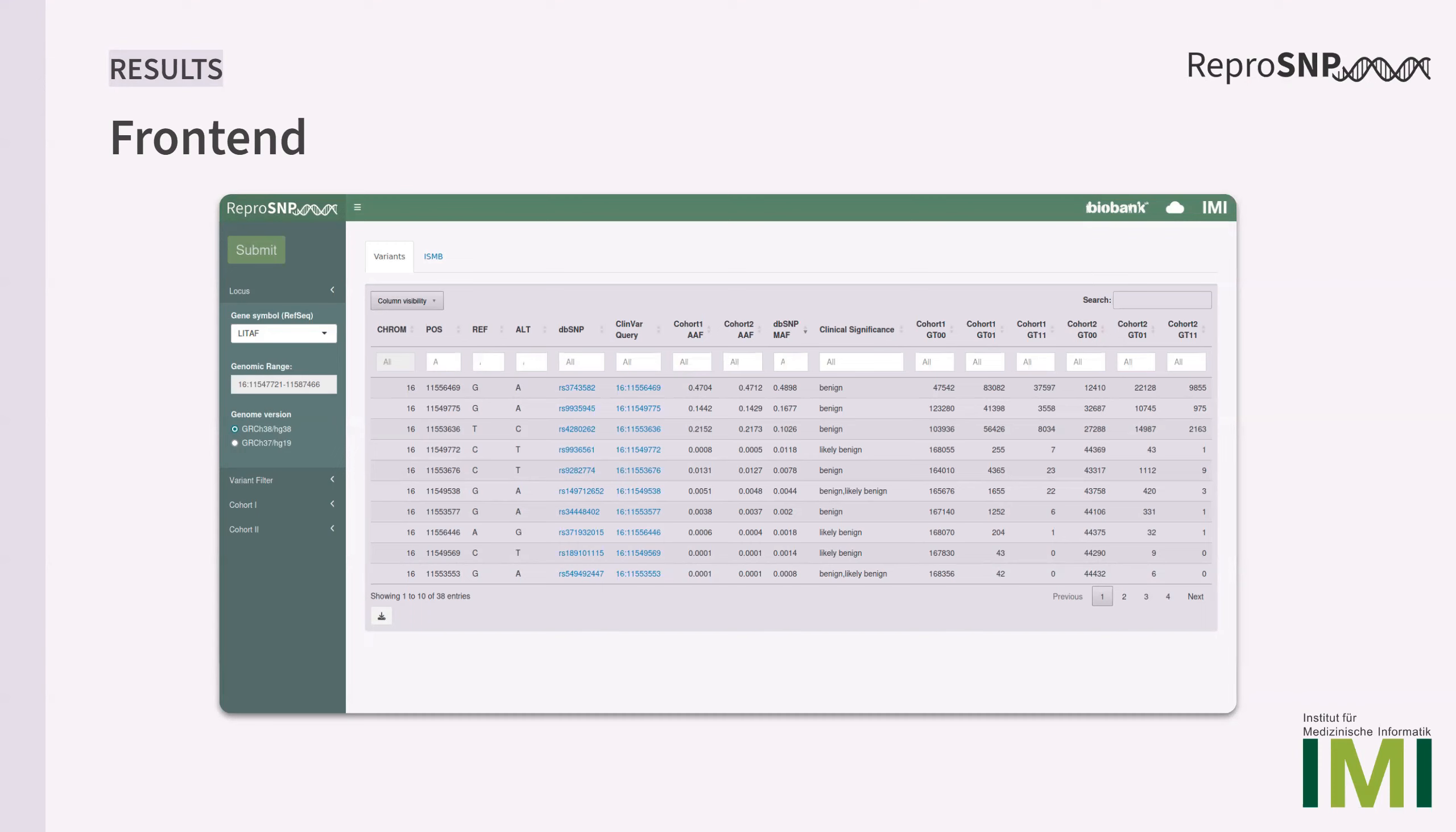There's also the option to expand the table to see more information like the statistical analysis, which consists of Fisher's exact test and an additional Bonferroni correction related to all variants in the selected genomic range to find differences in the allele counts between the cohorts. The user is also able to download the results as TSV file for use in downstream analysis.